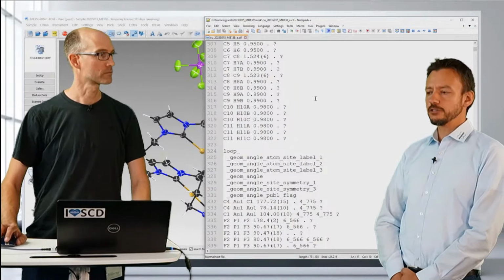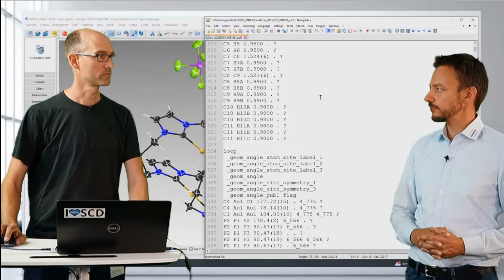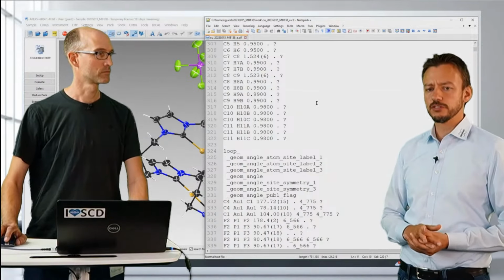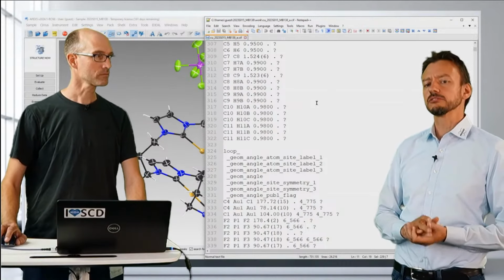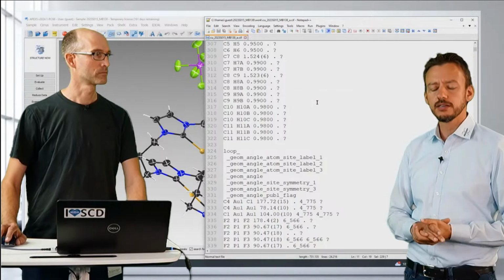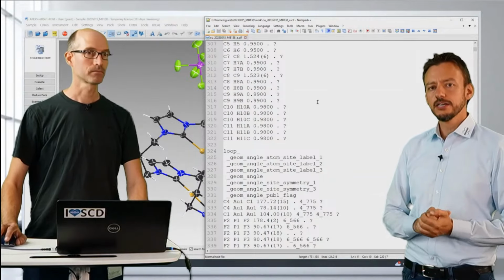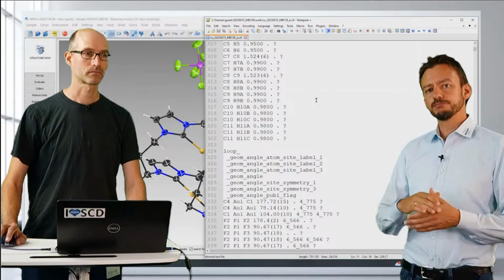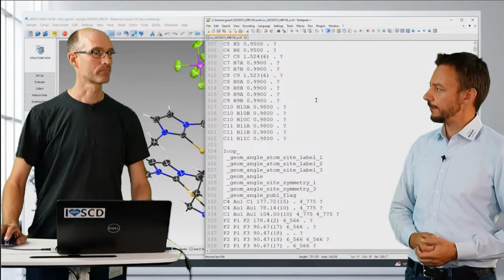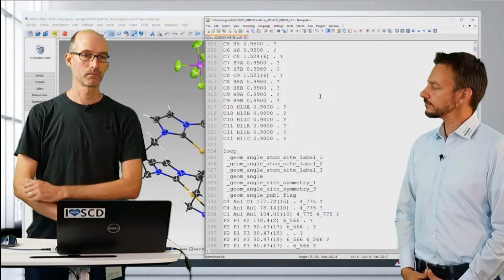Okay, so if you look through the crystallographic databases and download these CIF files, if you want to see published structures, you will notice quite often that most of the CIF files are quite, or to some extent, incomplete. So sometimes really important information is missing, and sometimes just basic information like crystal size or color is missing, which is quite sad, actually. So apparently, submitting a complete CIF or creating a complete CIF seems to be quite a challenge for the crystallographer. Yes, of course, and it also takes quite an amount of time.